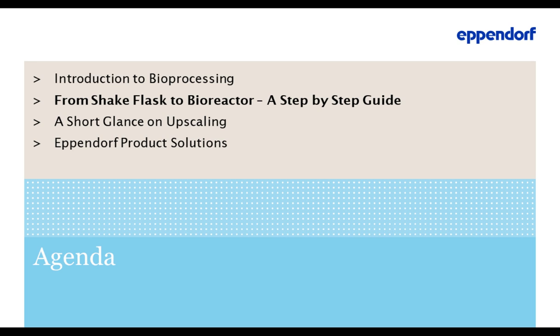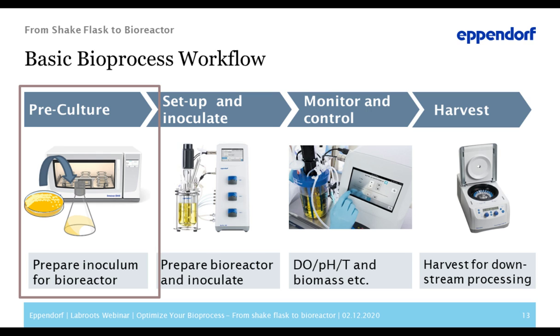next chapter. So you have decided for an expression host, selected the media, and have a first idea about what a bioreactor is able to provide. Now it is time to learn how to set up a bioreactor and learn what possibilities exist in monitoring and control and what kind of cultivation strategies you may choose. Here at that slide, you see a typical workflow for the setup of a bioprocess. We will go through it step by step.